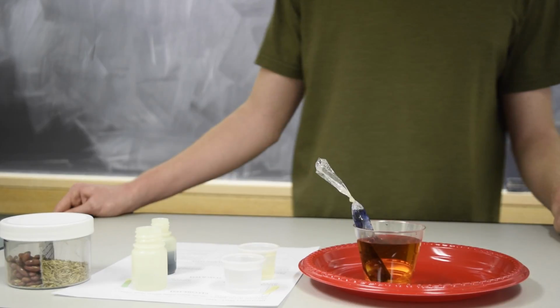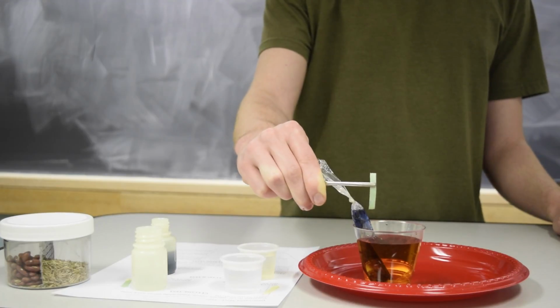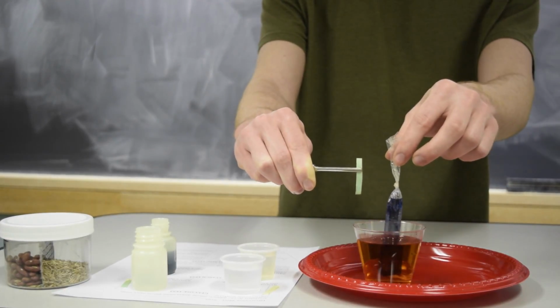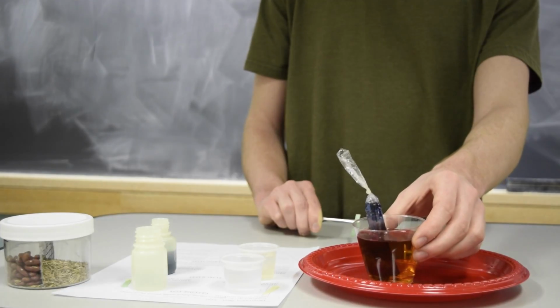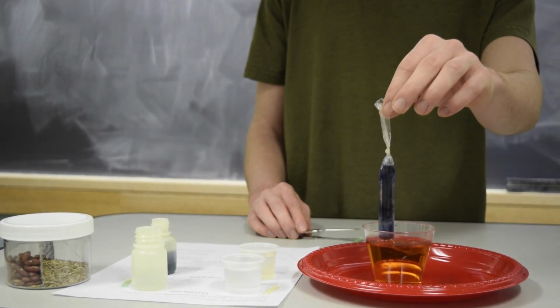To wrap up, we should go over the result of the experiment with students. Glucose gave a positive result, meaning that it could pass through the semi-permeable membrane, or dialysis tubing. The iodine did not change color in water, but it made the solution in the dialysis tubing turn black. This means that there was starch trapped inside.